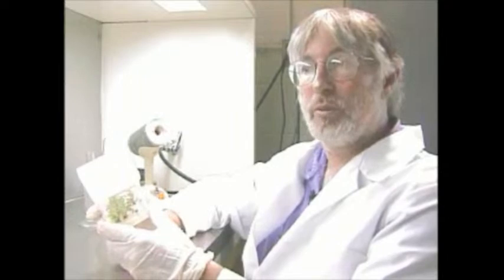But these are shoots without roots. And so what we have to do is induce adventitious root formation on those shoots. We do that by either placing them on a fresh nutrient media that contains the rooting hormone, auxin, or we can take these microshoots out of culture and place them up in the greenhouse under a special fog tent. And they will basically root just like a cutting that we discussed earlier, except on a very, very small scale. And we'll wind up with rooted microshoots that can be grown on into full-size plants.